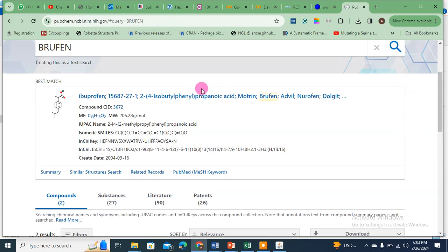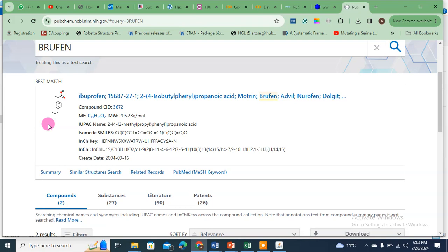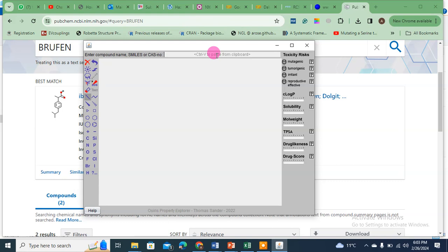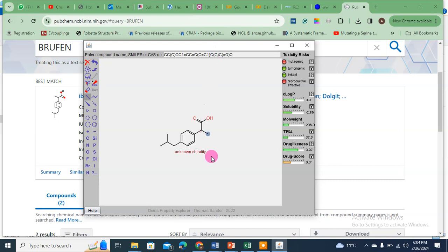Ibuprofen is a name of a medicine but also a compound — commonly used as a painkiller. This is ibuprofen on PubChem. This is your compound — or it could be any compound. From here, you see the isomeric SMILES — just copy it and paste it into the Property Explorer tool, and click Enter. Just wait about 10 seconds.